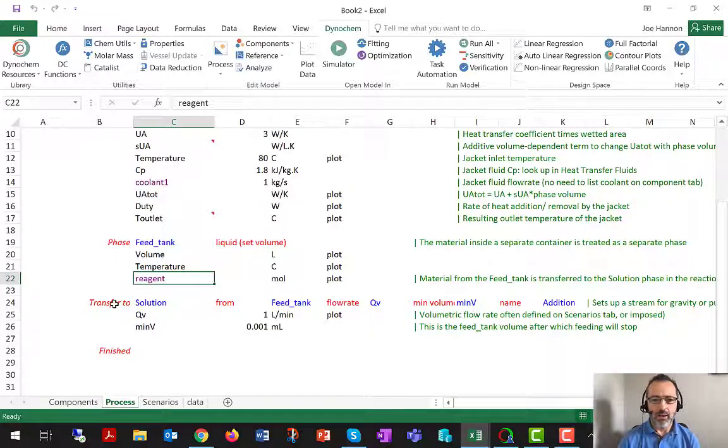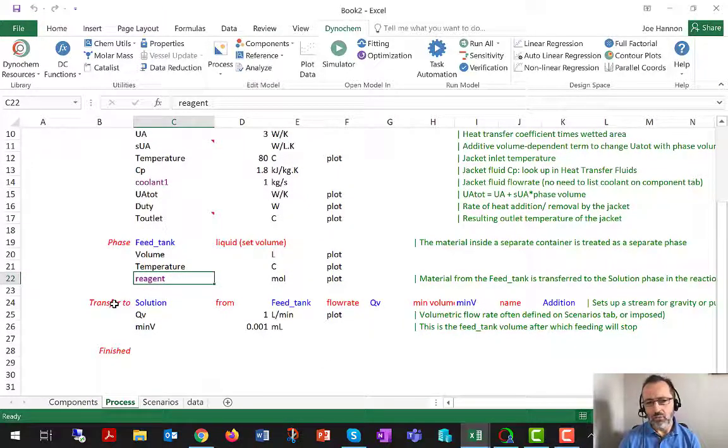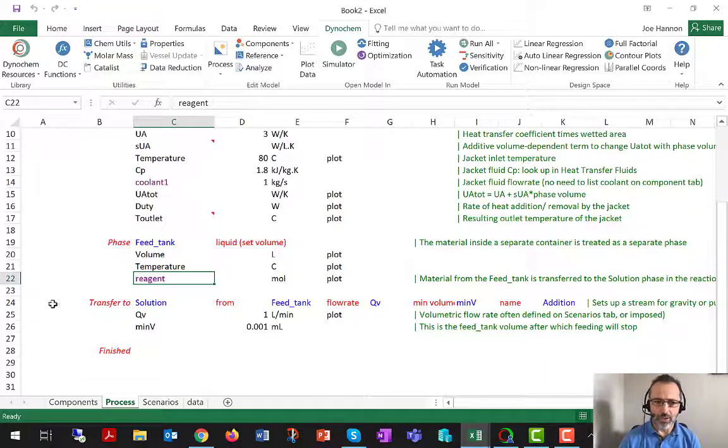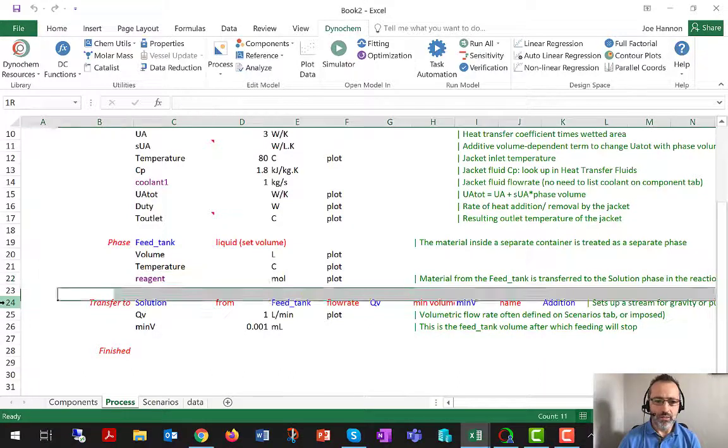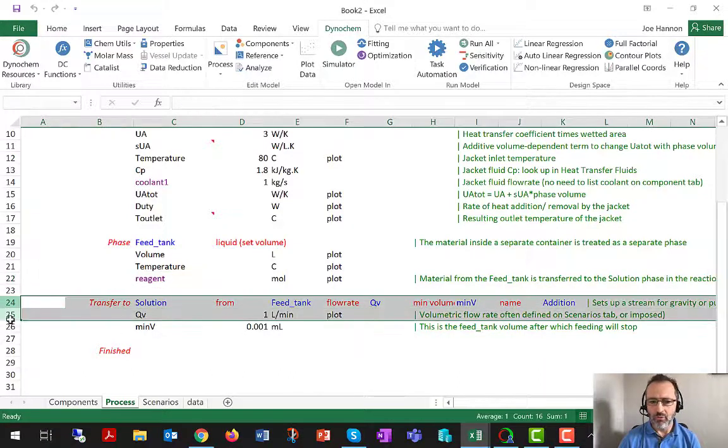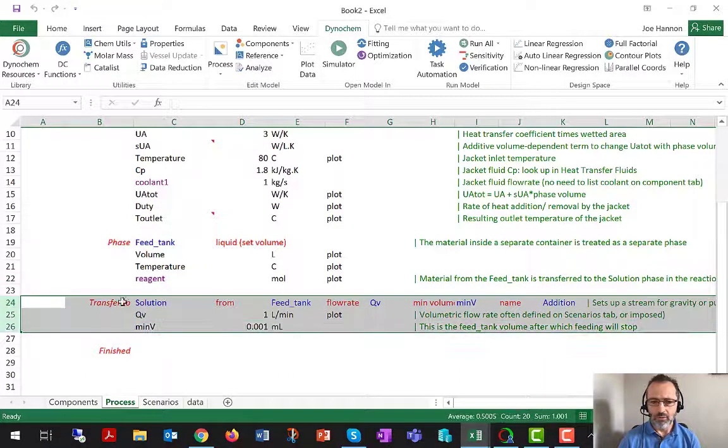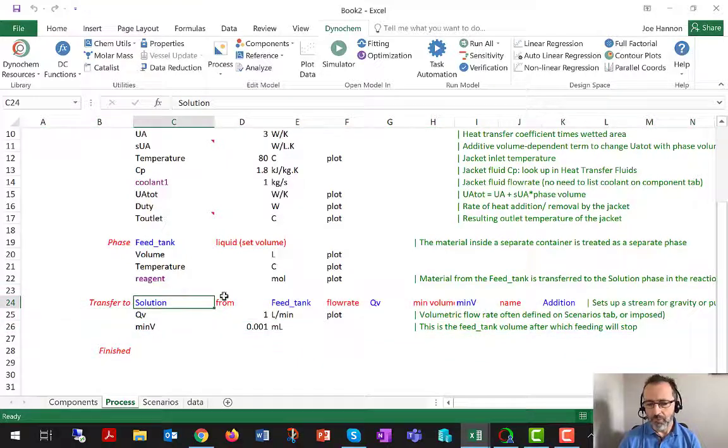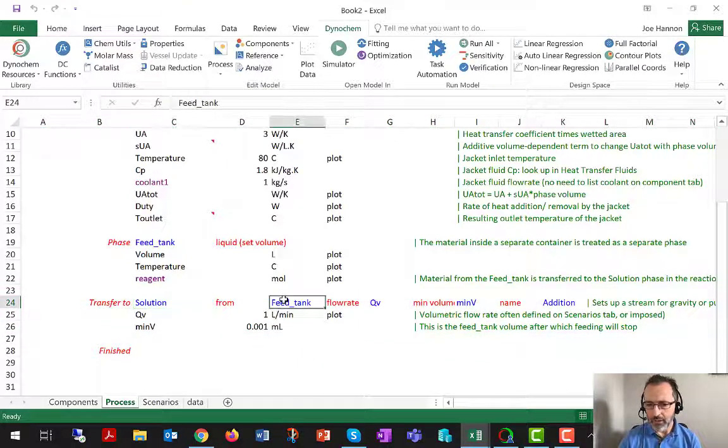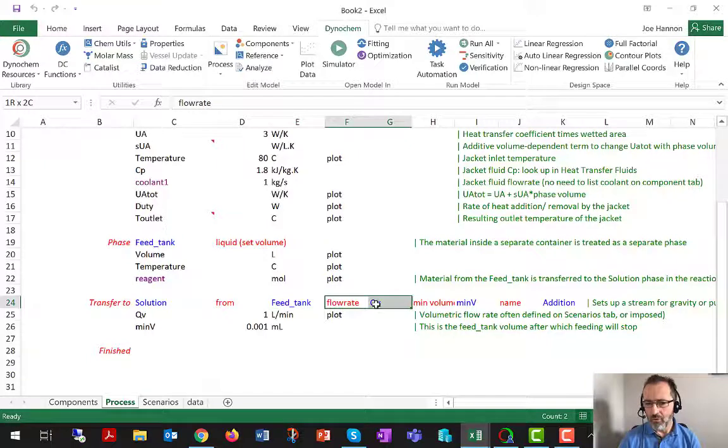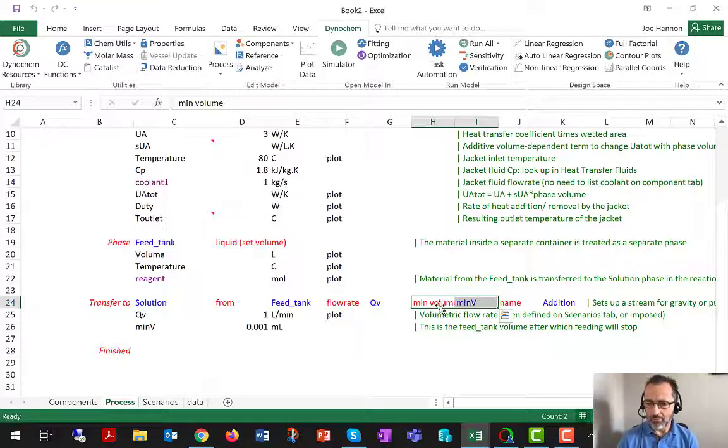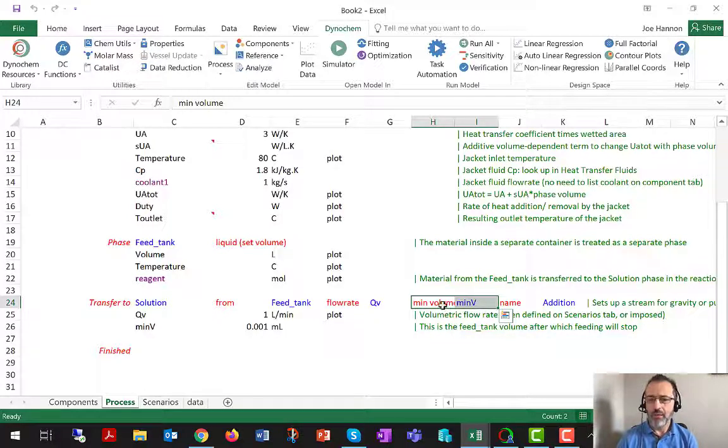And then a new rate process that has been added as part of making the process fed batch is a transfer to. So this is going to transfer to the solution whatever is in the feed tank at a certain volumetric flow rate QV, until the volume in the feed tank has reached a certain minimum volume.